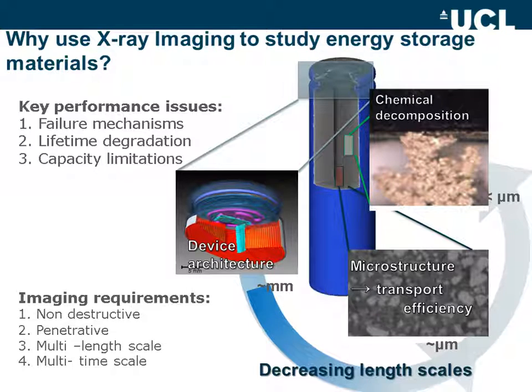Why are we using X-ray imaging to study these energy storage materials? Well, I've already mentioned failure mechanisms as a key performance issue, but also as we move to larger and more expensive battery packs, we want to overcome capacity limitations and we want to prevent lifetime degradation. The imaging requirements for us are that it's non-destructive, ideally penetrative, so we can see what's happening beneath the surface of the battery, and possible over multiple time and length scales.